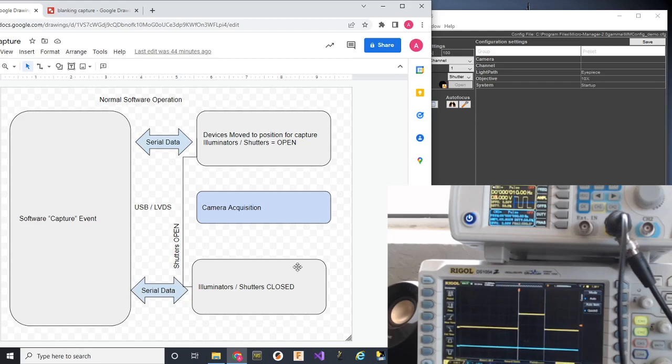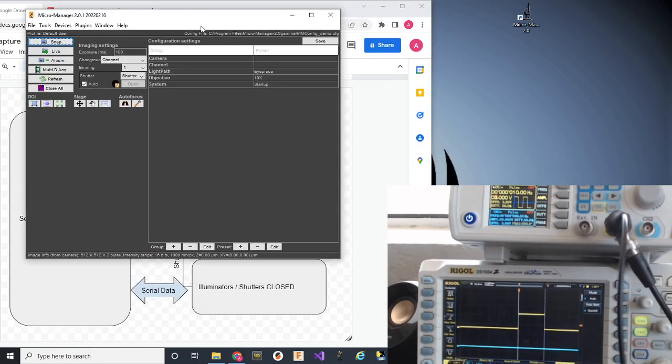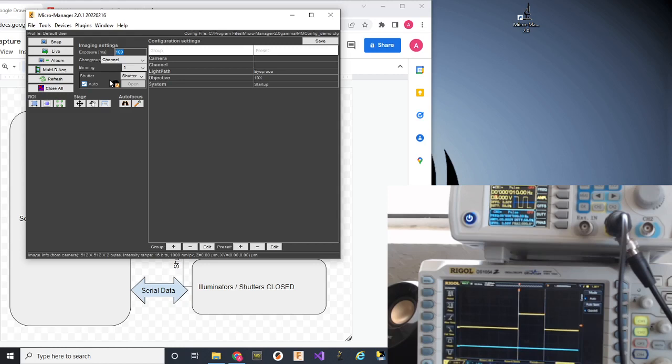Right now I have a demo camera connected to Micromanager. This is a fake camera. It has no correlation with the real world. But I also have a trigger scope physically connected to the system. And the trigger scope is set up as a shutter. When I snap an image with a duration of, say, 100 milliseconds, the system will enable TTL1 for 100 milliseconds. Then it'll tell the camera to take a picture, and then it'll disable TTL1.